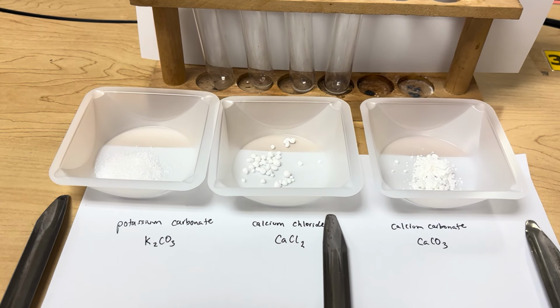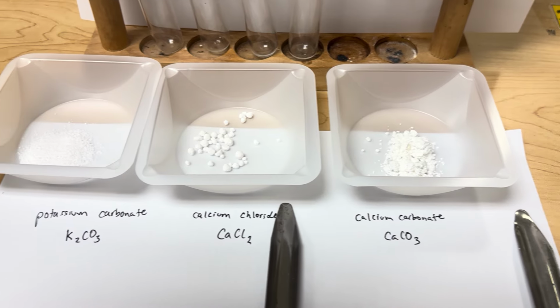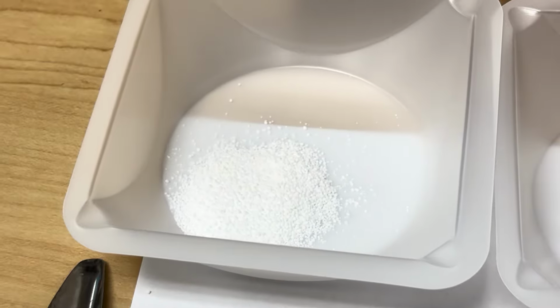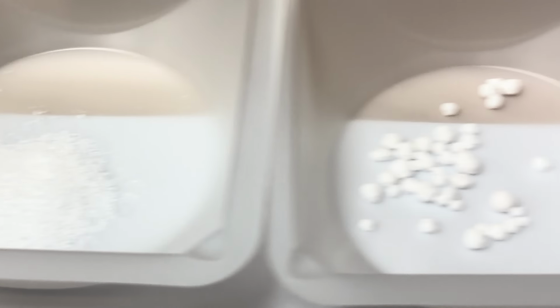All right, so I have three ionic compounds here: potassium carbonate, calcium chloride, and calcium carbonate. Looking at all three substances, we can see that they look somewhat similar, but also different. They're all white in color, but they're kind of different textures, I guess.